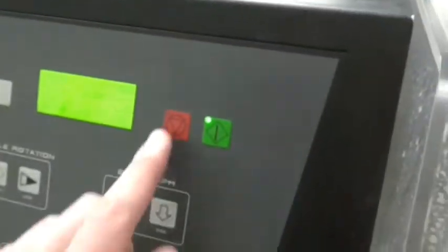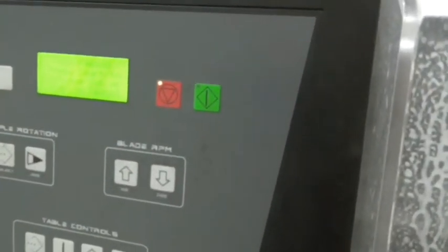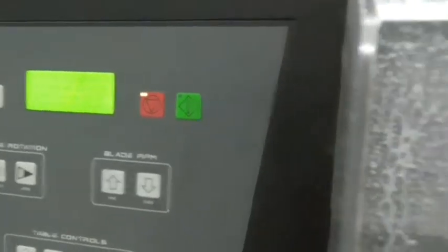The sample has dropped down, so we are going to go ahead and press the red button. We are just going to open this door.